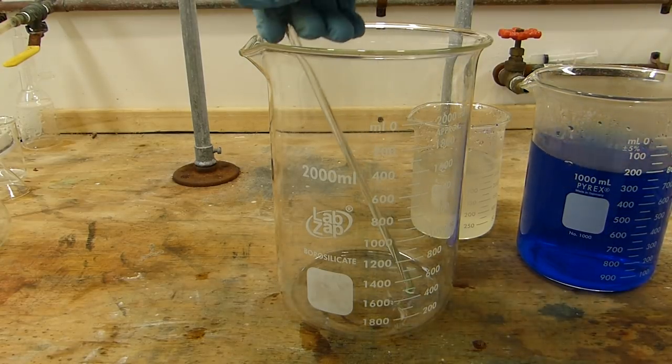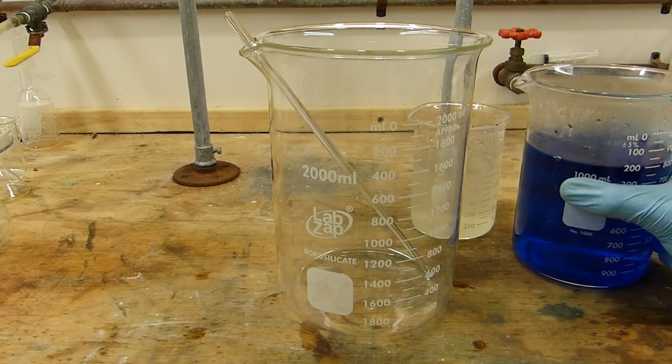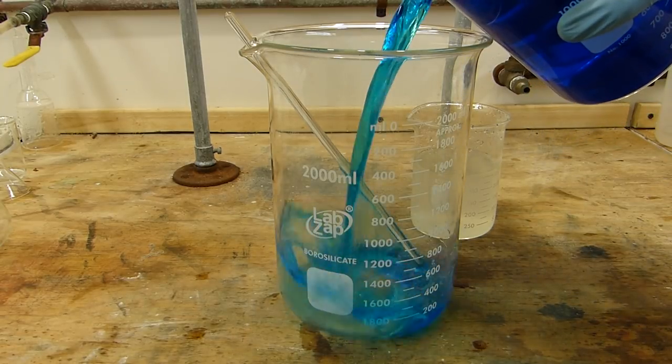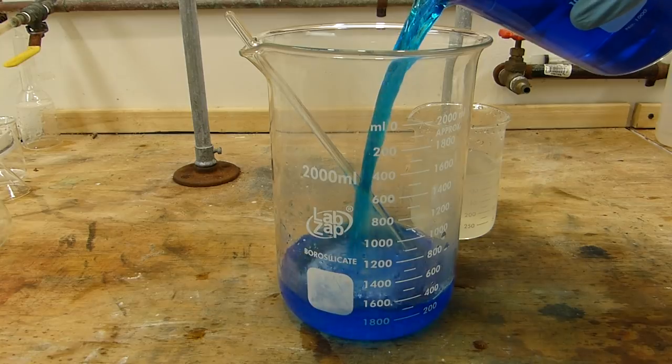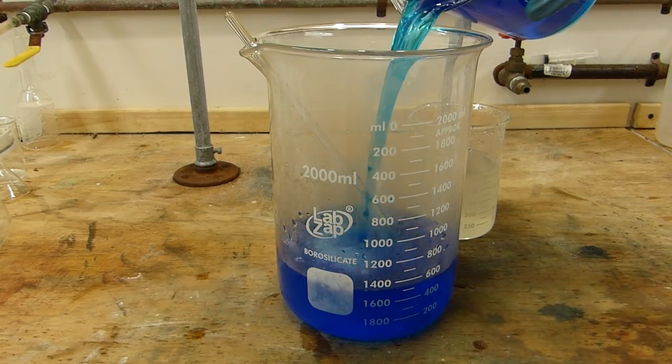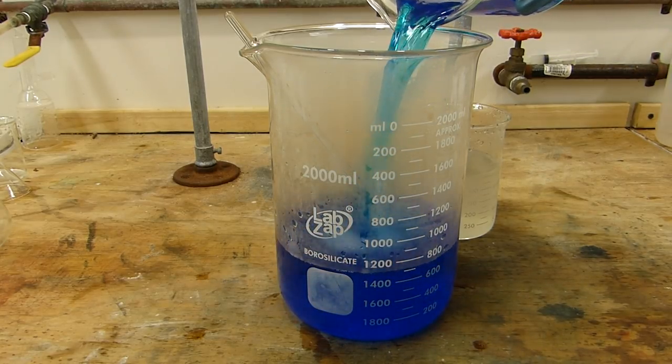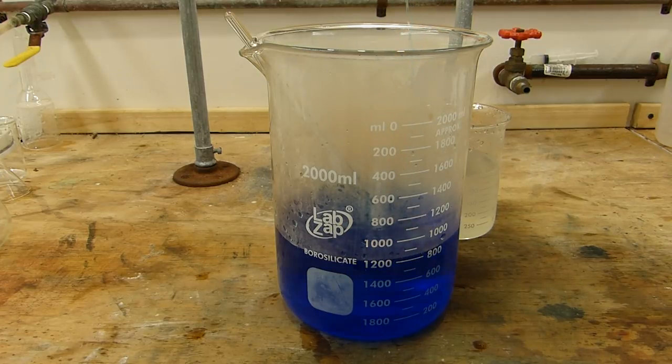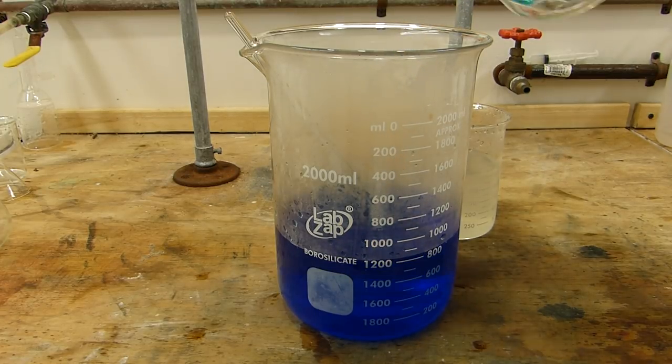I'm going to use this two-liter beaker here because this is quite a big reaction. I'll first pour the copper sulfate solution into this beaker. Great color. There we go.